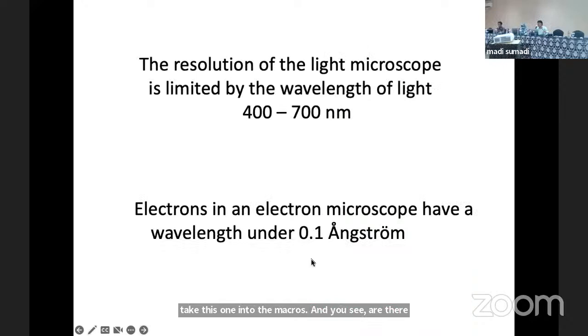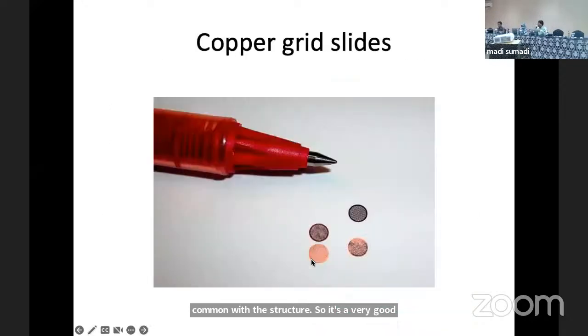It's a very good technical point that when you have these copper grids, you need to bake them for 20 minutes in the electron microscope so that the electrons pass through. It will be half cooked, like a pizza, you cook it half. In a similar way, it's also half cooked. And once it is there, then you can put our sample on it. Sometimes the electrons hit the sample and break everything. So in order not to break the sample, you put a coating as a kind of support.